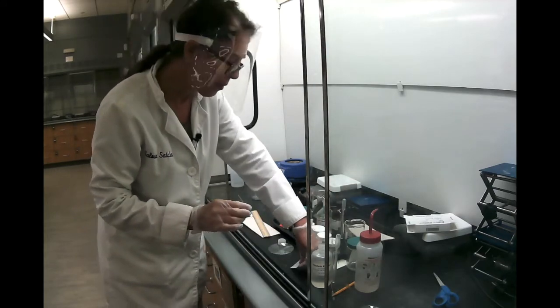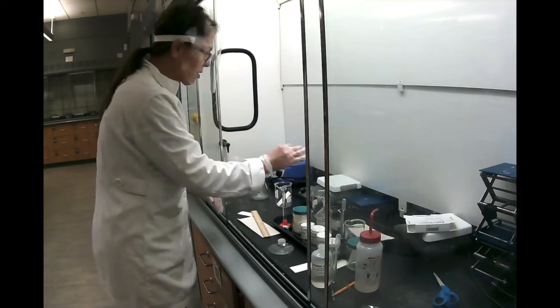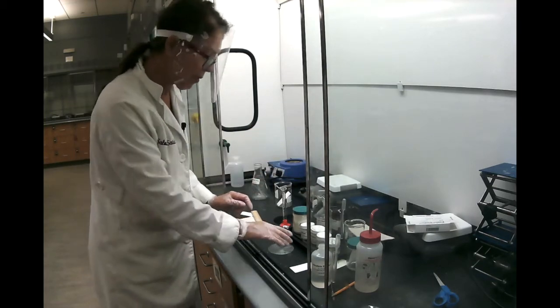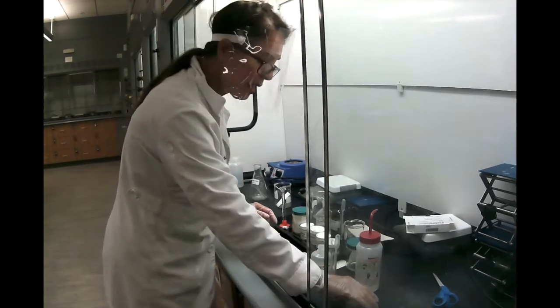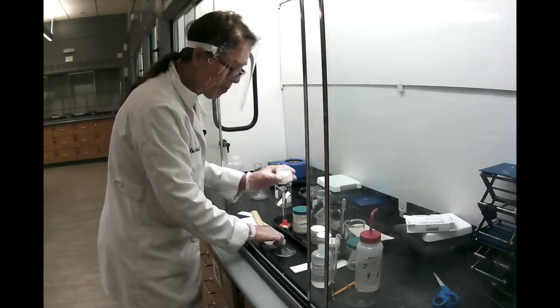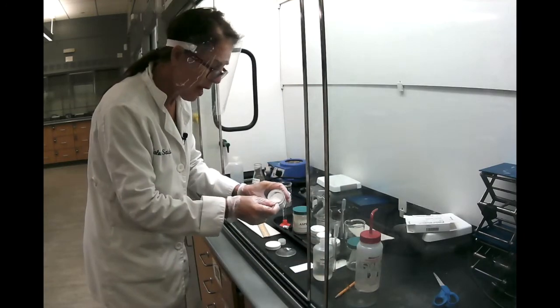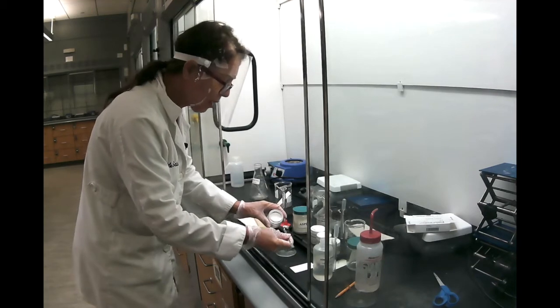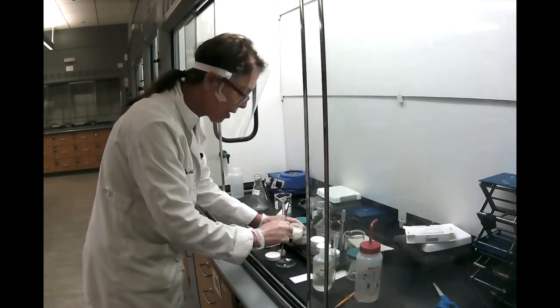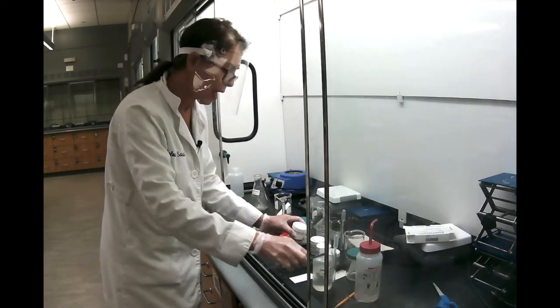When you're done with that first substance, make sure you have a beaker for your waste, for your used capillary. Then you go to the next one, and you repeat. A tip of the spatula of the substance in your watch glass, a few drops of ethanol, and you start all over again.